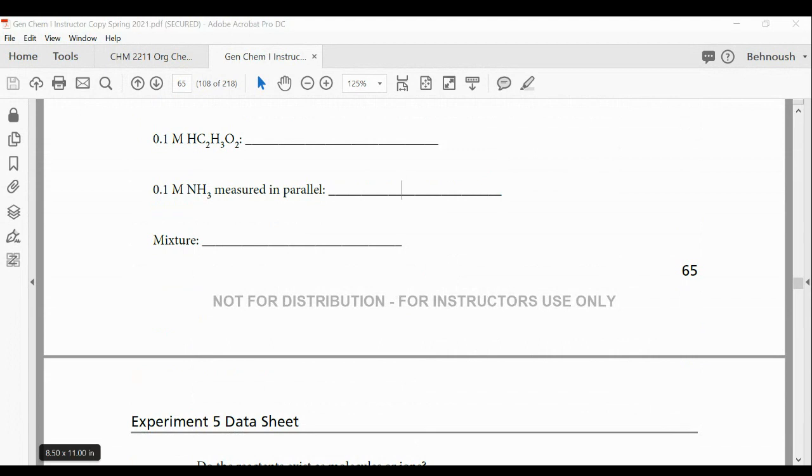If not, I'm going to call for attendance and ask you to watch the video and pay attention to the reason why these compounds are electrolytes or non-electrolytes, not just writing the observation that it was a bright light, a weak dim light, or no light, because that's not very scientific. What is scientific is to say why: does it generate lots of ions, or no ions at all? What type of ions is it going to generate?